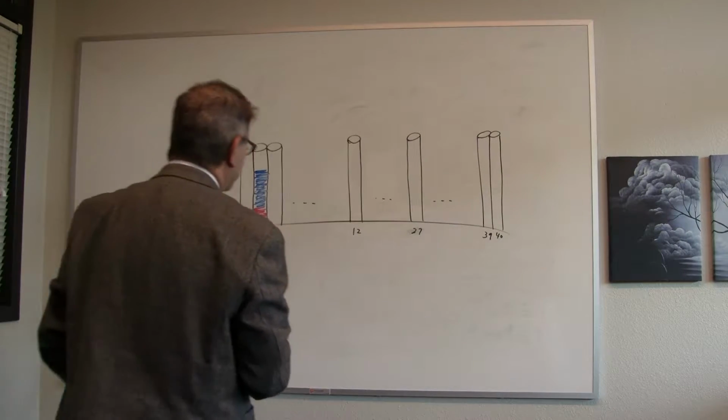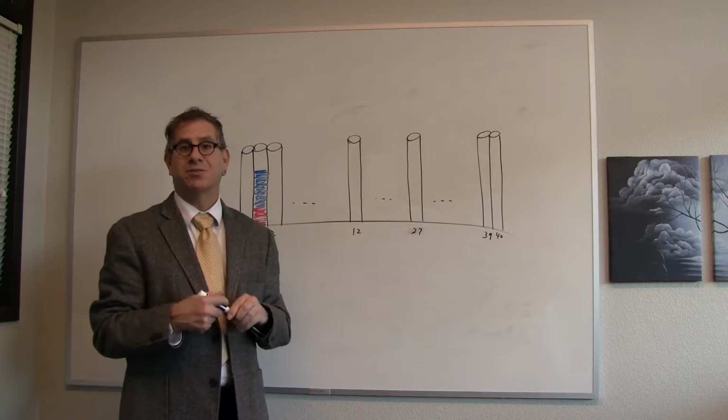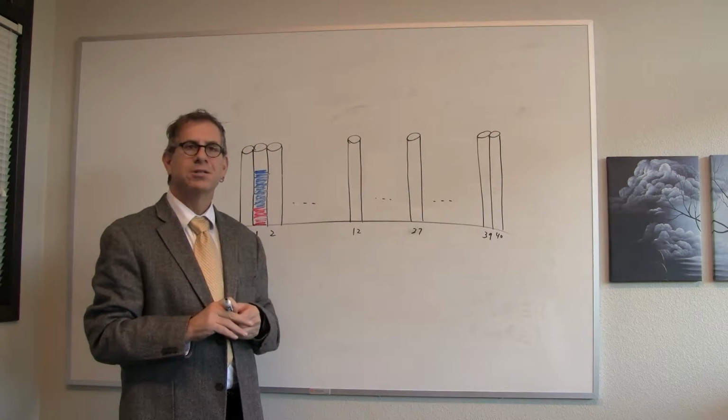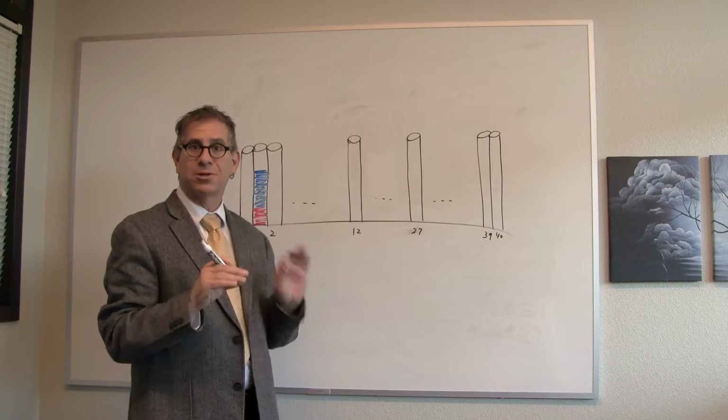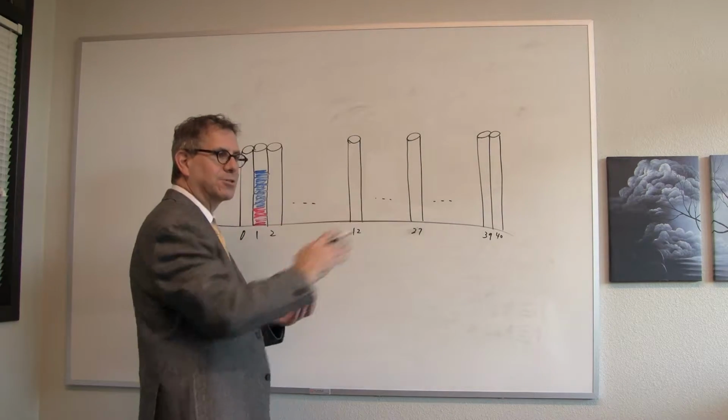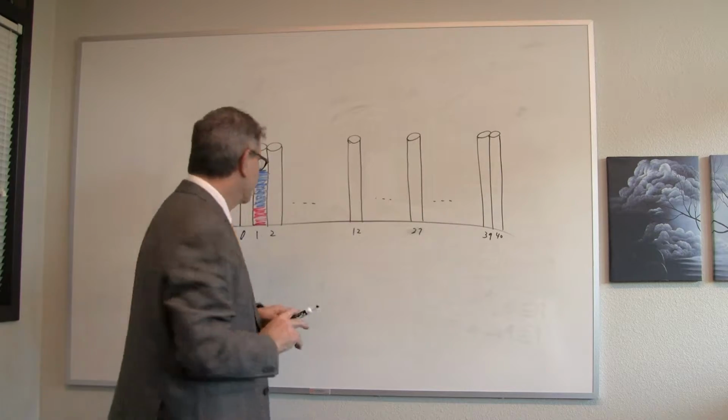Alright, one other thing that needs clarification is this question of transferring between two tubes. I've been saying transfer source to destination, but that's not really what's happening in the current version of the simulations. We can do versions where we actually have a directed transfer, but here's what we're working with right now.